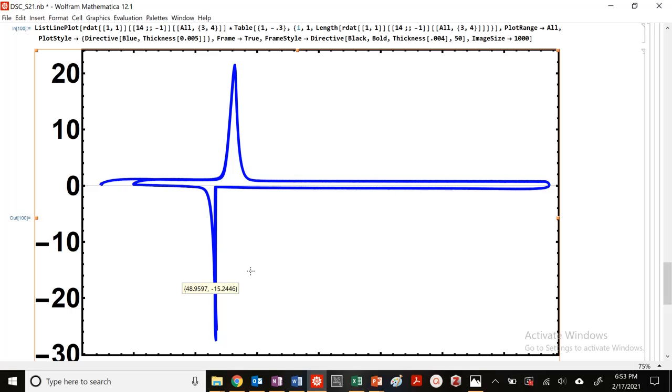Well, it's all about the kinetics, right? We're running this experiment at 10 degrees K per minute. So we're melting quickly, and then we're cooling down quickly. Before we give time for the atoms to rearrange and solidify, we're already past our melting temperature. So there's this kinetic factor in addition to the thermodynamics. If I were to slow this down from 10 K to 0.01 K per minute, my degree of supercooling would be much less. My lines might end up right on top of each other.